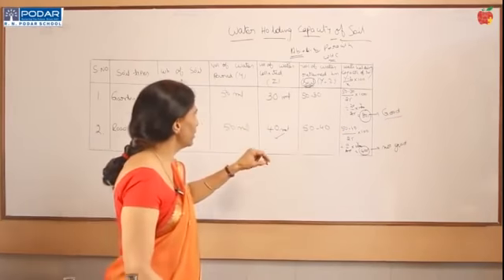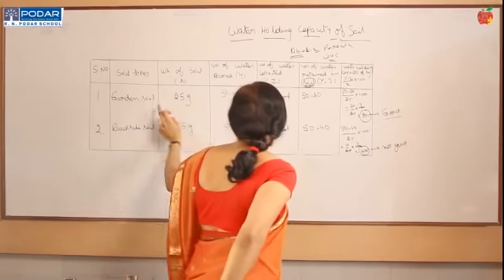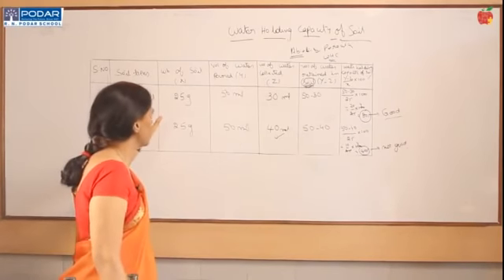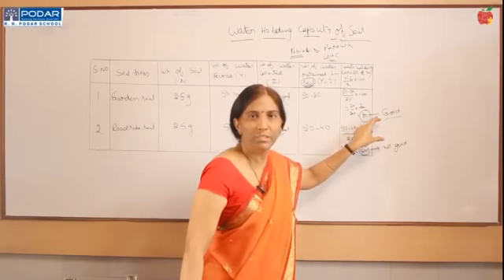So, the viva question will be: why is water holding capacity more in garden soil compared to roadside soil? Because of the organic matter or humus present in garden soil, which helps the soil hold more water. So, this is the best soil, hence it is proven now.